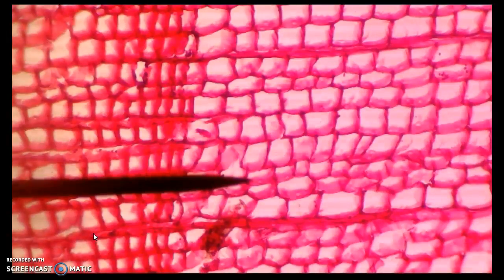Okay, and then I'm going to shift over to the highest power, the 400 power lens. Okay, and it's almost in focus. I'm going to adjust it just slightly so you can get a little better. I think right there. Okay, sketch what you see in that circle.